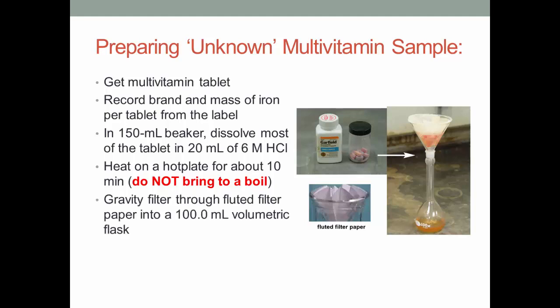Then, gravity filter through a fluted filter paper into a 100 ml volumetric flask, and dilute to the mark with deionized water.